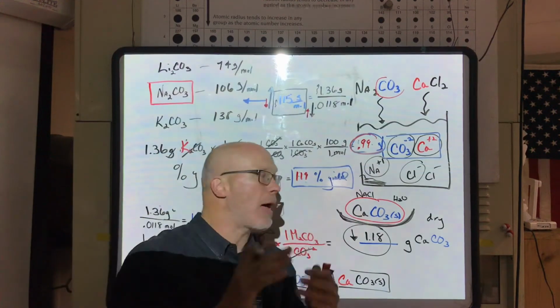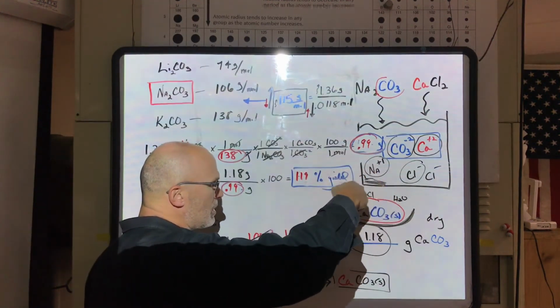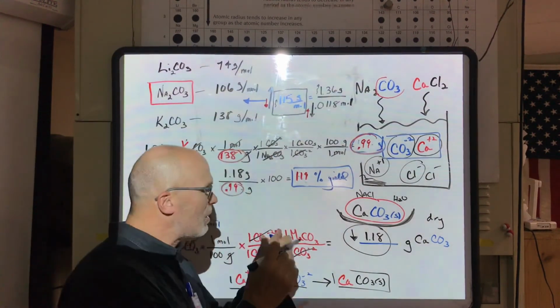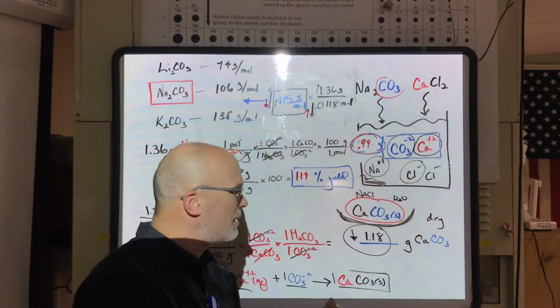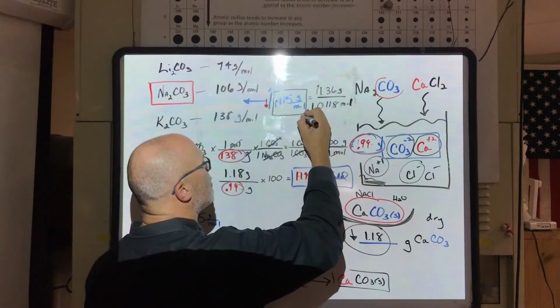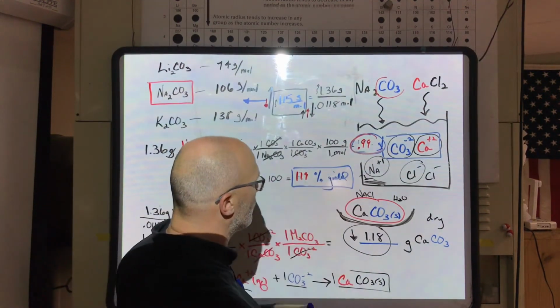As if I had this filtrate that had these free ions, and if we didn't wash off our precipitate with distilled water, as I probably did not in the video, as it dried, as the water left, the sodium chloride would come together, and you would have at the end of the day sodium chloride crystals on top of that, which would also be another competing error against the loss of the precipitate. That would do what to the grams? It would make it heavier, okay?